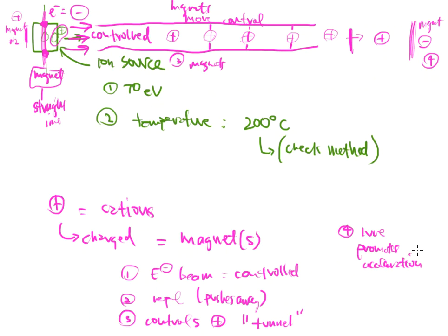There's a lot going on. I mean, this is in no way like our UV vis instrument. This is really not our infrared or AA. And you've got to keep in mind that this is just the detector. This really isn't even an instrument. It's not doing any type of separation at all, which makes this even more complex because there's front end things that are going on before it even reaches this step.